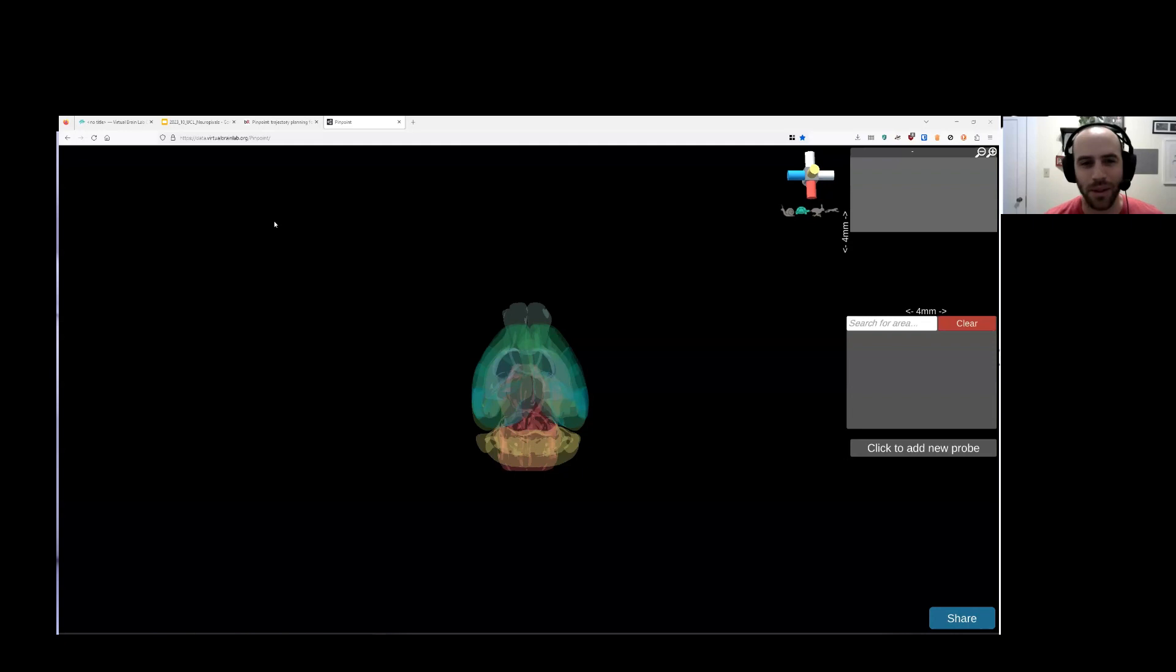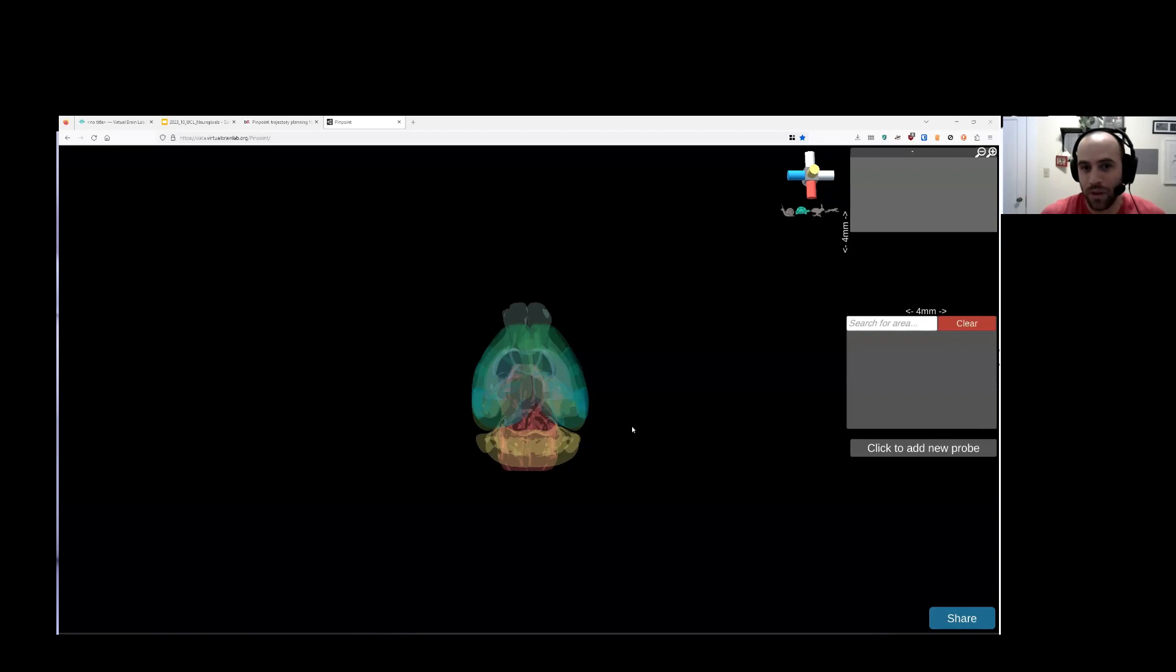We are just presenting three different options for trajectory planning that you can use. NTE is in MATLAB, ERBS is what you just saw, and then Pinpoint is the one that I've built. And I think one reason that I really like what I've built with Pinpoint is that it is sort of web first.